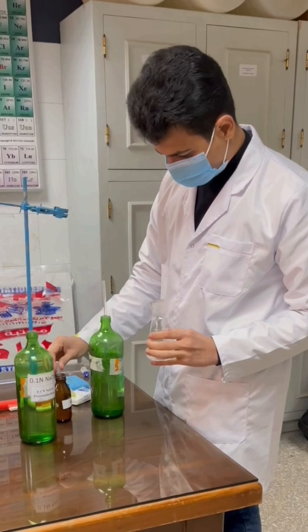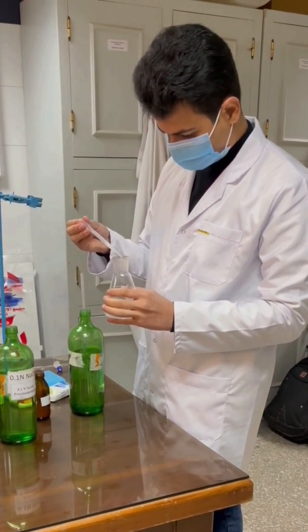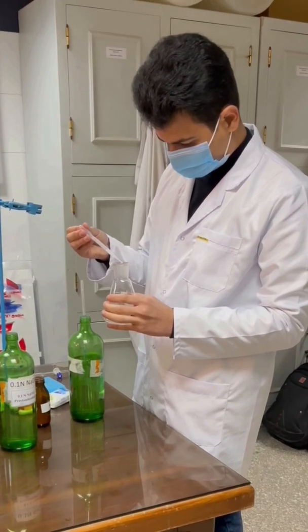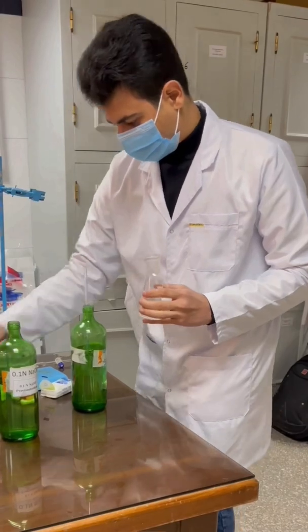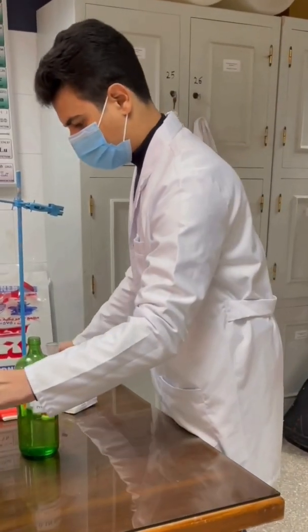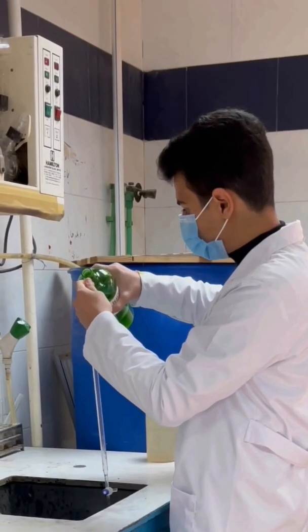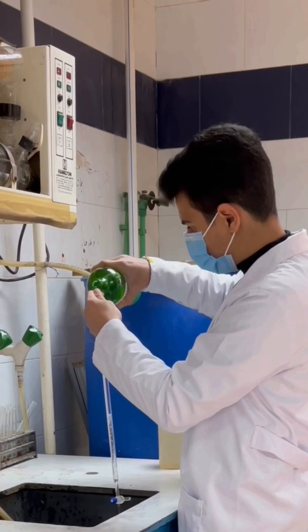Then we're gonna add 10 drops of phenolphthalein as an indicator. Then we add NaOH in the burette as a titrant till the number is 0.